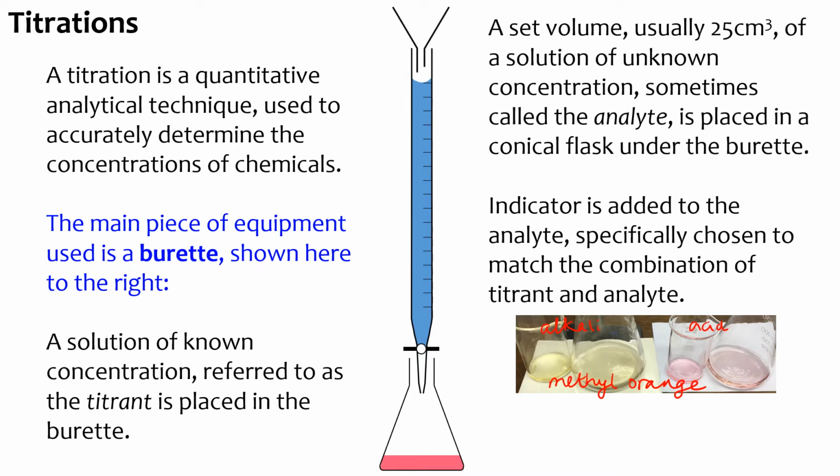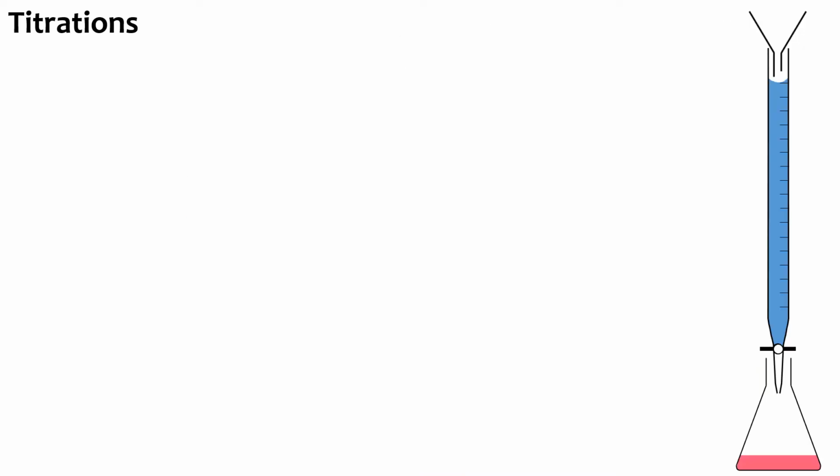So looking at the equipment we've got set up, are we ready to start the titration as I have it set up just here? Can you spot any issues with my equipment? Okay, so I've just moved the equipment over just there. So looking at this, there are actually two main errors on this diagram. So there are a couple of errors that we can see here.